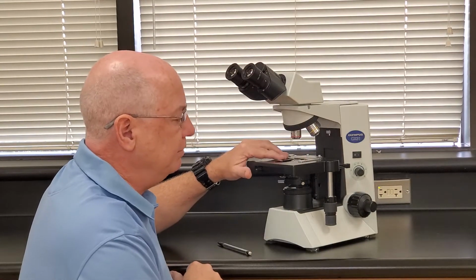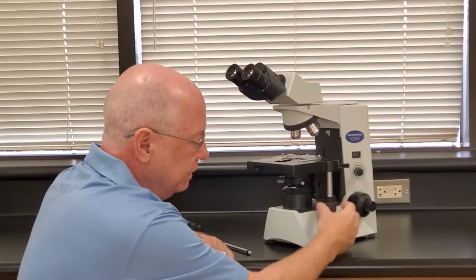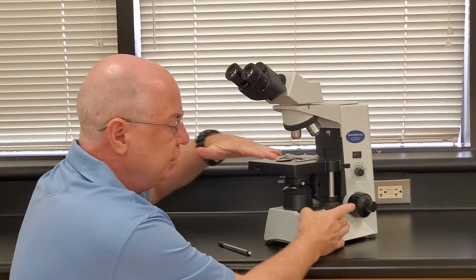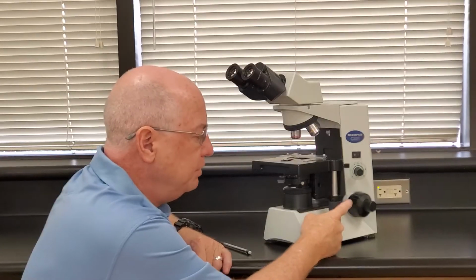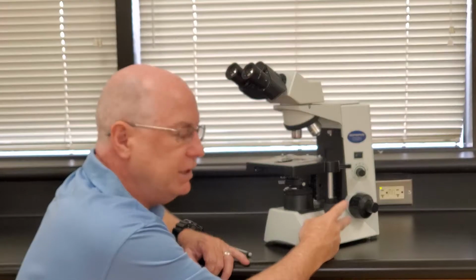So, when I ask you to mount a slide, you're going to mount it using the stage clip. Now, on the side of the mechanical stage, there's a metal stick here that has 2 rubber knobs. The bottom knob moves the stage or the stage clip laterally in the y-axis, and this would be moving it front and back, or this way in what we would call the x-axis. So some people call this the x-axis and the y-axis control knobs. I don't care if you know which one's which, you'll figure it out. So if I ask you for these knobs, these structures right here, they're called the stage control knobs. That's the term I want you to use. The stage control knobs control the movement of the stage.